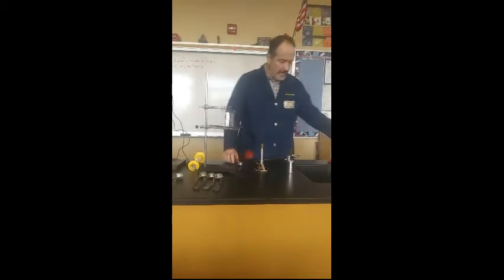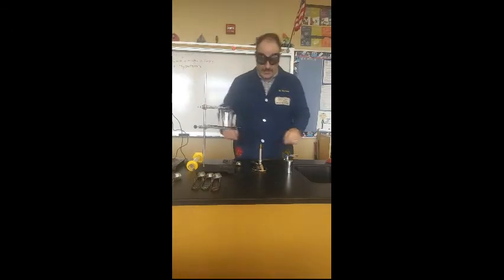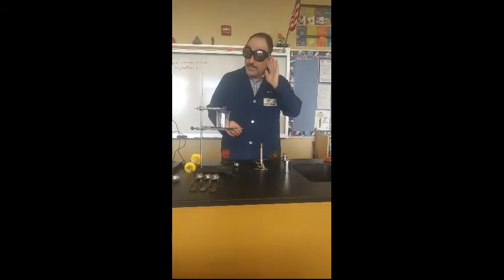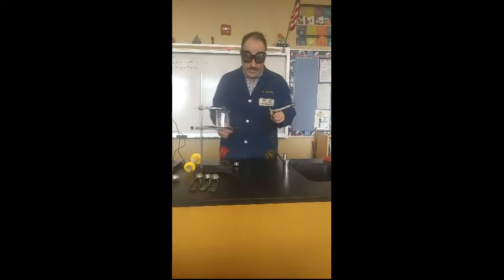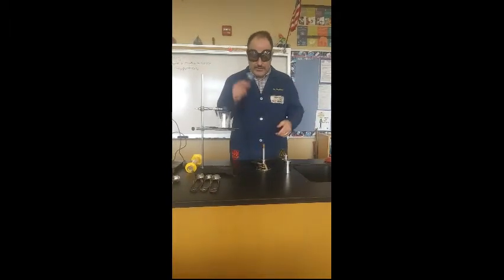So you got it all set up and you got your goggles on, all right? Got your goggles on. And you go ahead and you turn on the gas, remember, parallel to the nozzle. Now you should be able to hear the gas. If you can't hear the gas, make sure you've opened the valve correctly, okay? The gas adjustment valve.